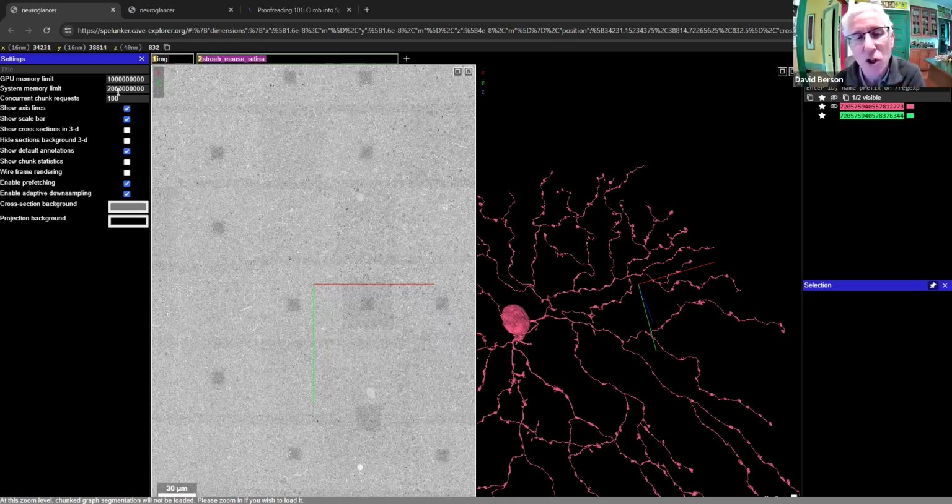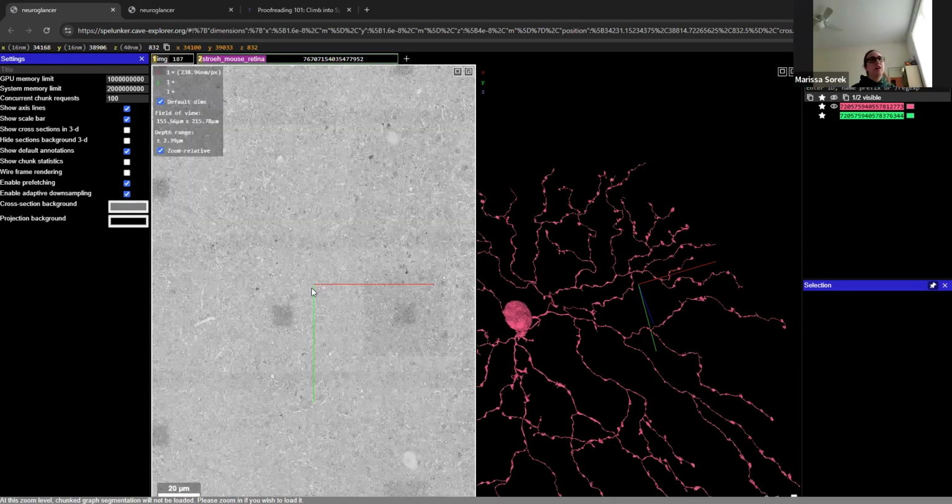And there's especially only one resolution of the pre-computed mesh that gets loaded. You don't have a downsampled version that would load faster? Yes, that's correct.